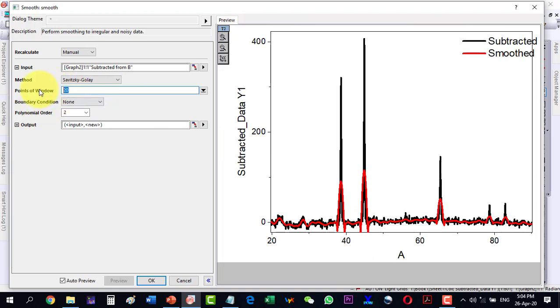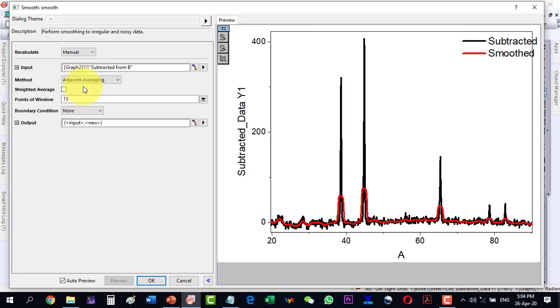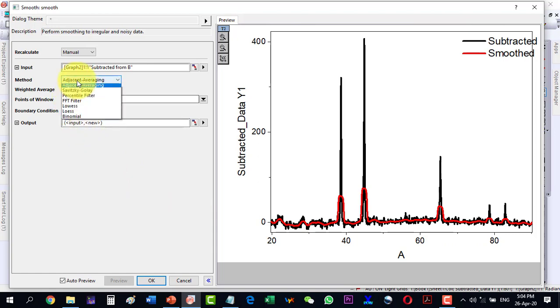And here I go to let's say another method which is the Adjacent Averaging. And as I go to Adjacent Averaging, then I see that it is changing the peaks. So I will keep this method.